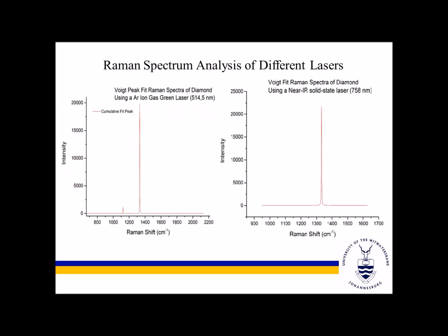For the second part of the experiment, we actually had to use a furnace to incrementally increase the temperature of the single-wall carbon nanotubes. So this is the first characteristic Raman spectrum, of diamond. We have a primary peak at 1,332 with a full width half maximum of 1.2, indicating the interaction of two cubic sublattices and the purity of the diamond crystal.